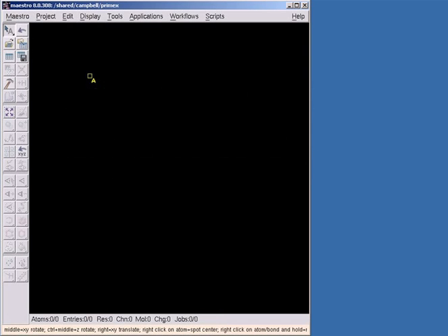In this video, we're going to talk about getting started with PrimeX, how to import data into a Maestro project, and how to perform a quick R-factor calculation. Now, Maestro is the interface to all Schrödinger software, including PrimeX. When we first get started with PrimeX, we'll usually begin with an empty Maestro project.